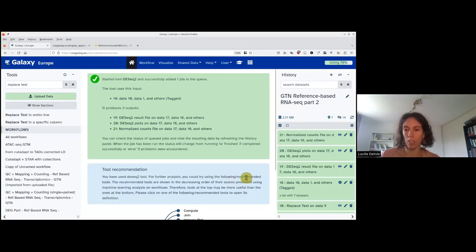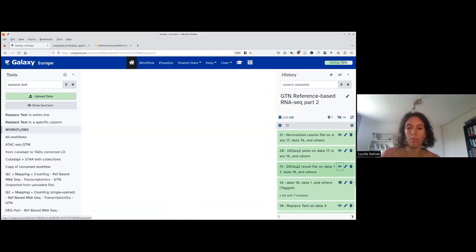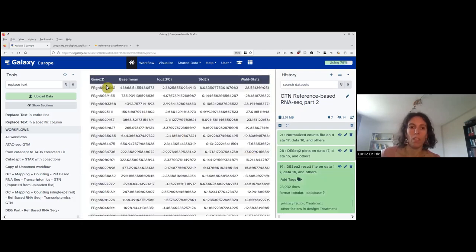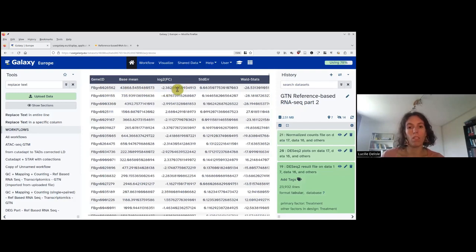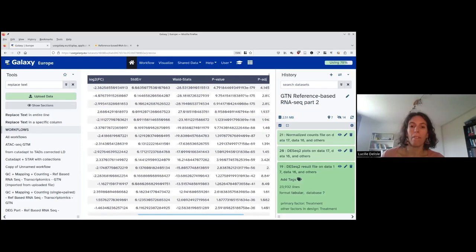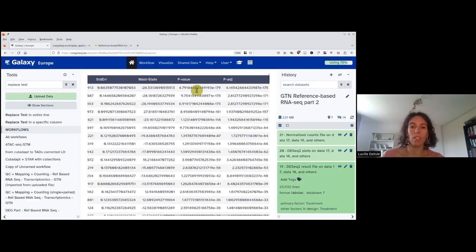Now it's done and we can check the results. The result file is a table. We have one row per gene with the gene ID. The base mean is the average normalized expression across all seven samples. Then there is an estimation of the log two-fold change, a standard error on the log two-fold change indicating confidence in this value, then a Wald statistic, and then a p-value and an adjusted p-value.